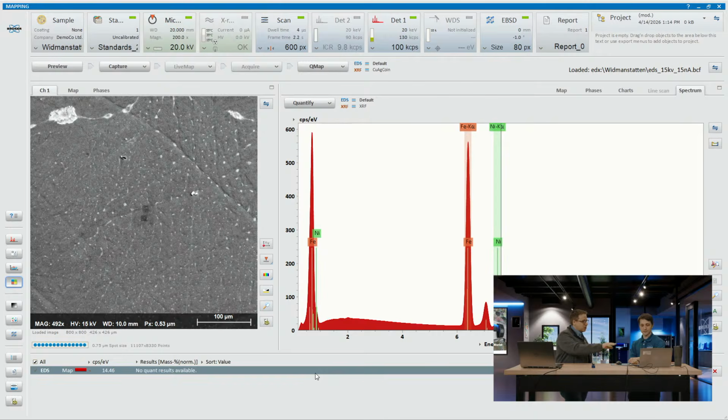So this is that ESPRIT software. This is the same software we were just looking at, the EBSD, right? Yep. That's really cool. You got one software. So we got this EDS data. Good result. We see it is confirmed iron nickel. That's in line with it being a meteorite.